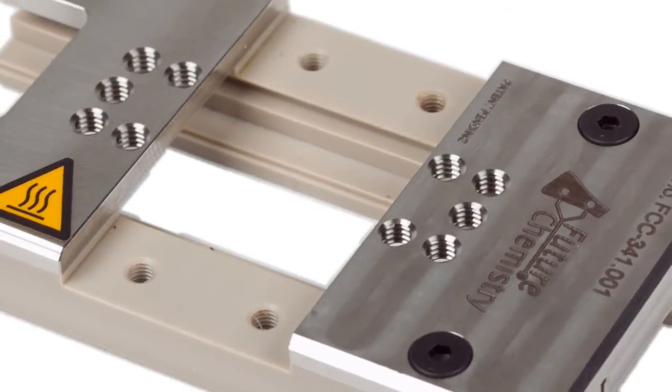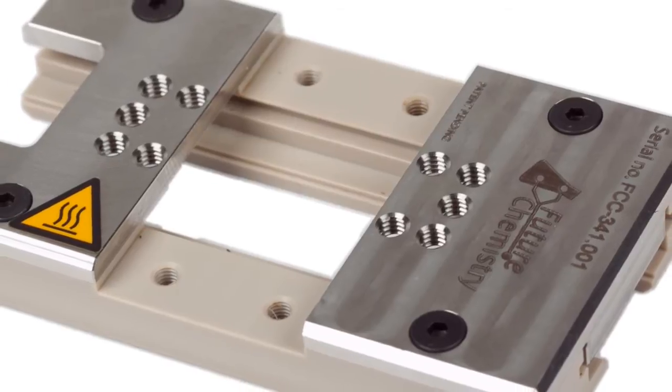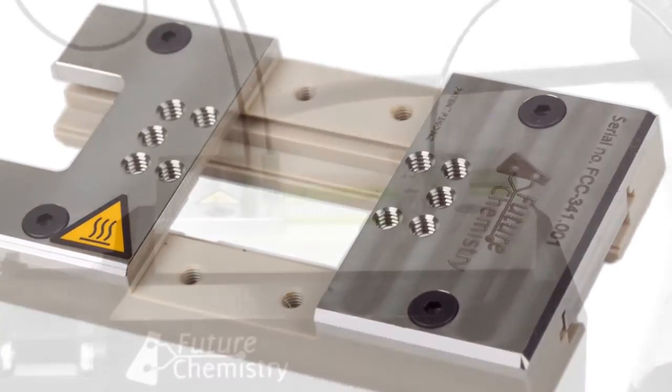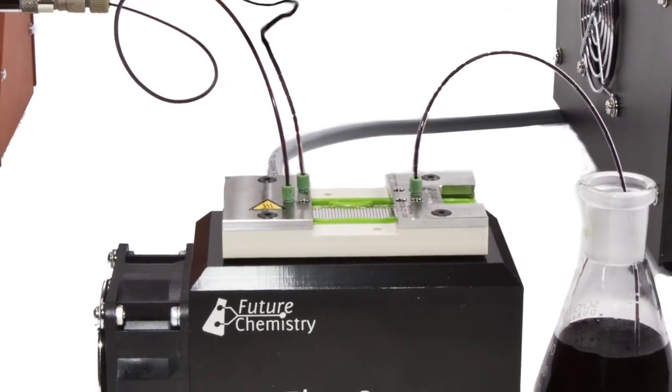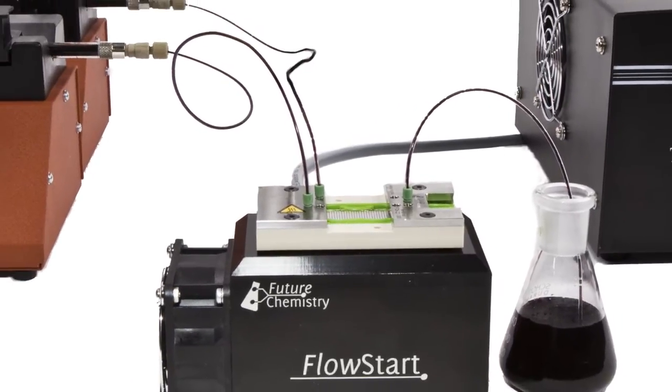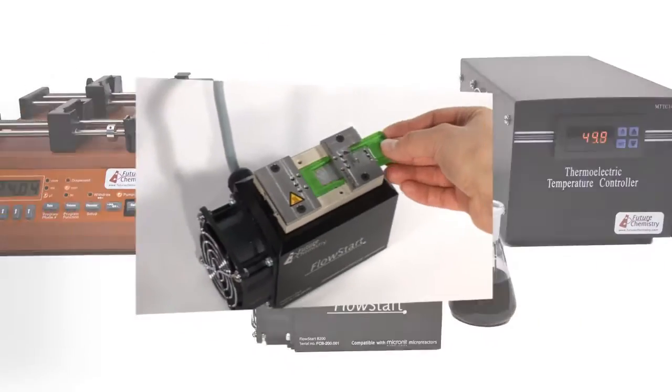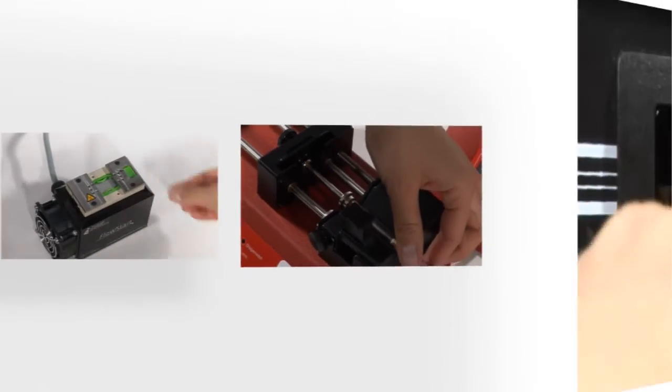This micro reactor is the core component of FlowStart. To use this micro reactor, you can install and run the complete system in just three easy steps.